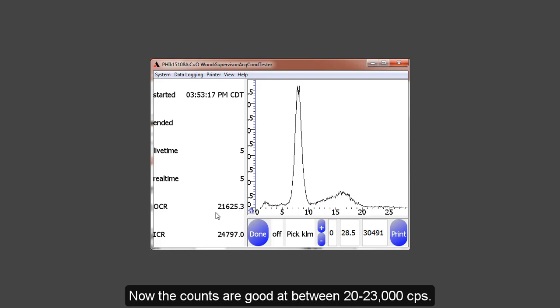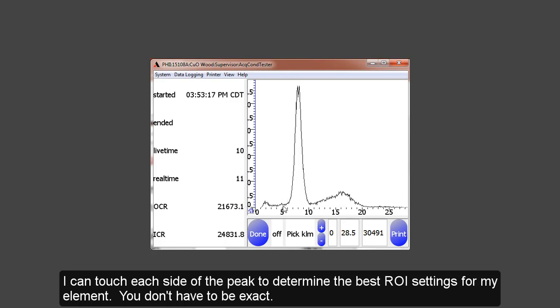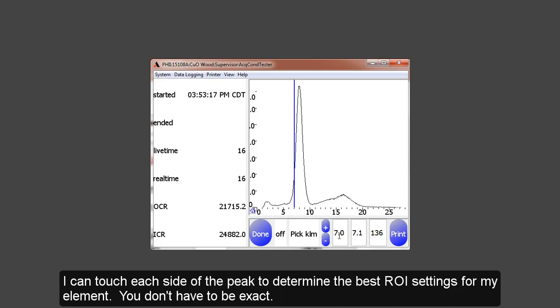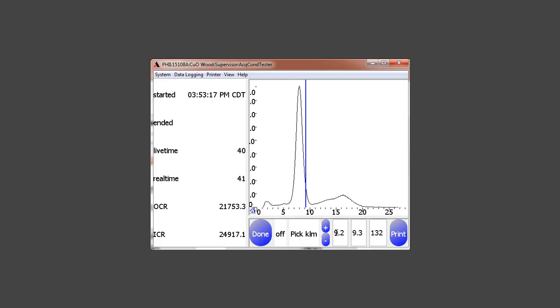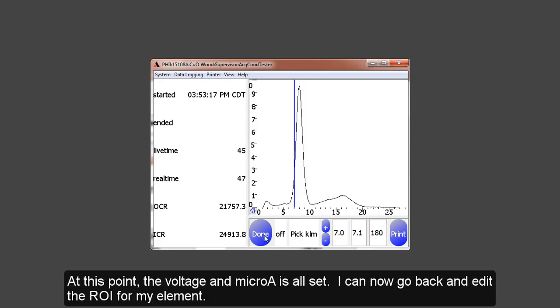You can see now my counts are great — they're between 20 and 23,000 counts per second. Now I can select the left side of the peak, and I can see it's actually two lines. I can see that the setting for the keV on the low end should be about 7 keV. And I can collect the right side of the peak and see about 9.2 or 9.3 would be good. You don't have to be perfect — it's not an exact science. So once I remember my settings, I have about 9.3 to 7. I can select Done.